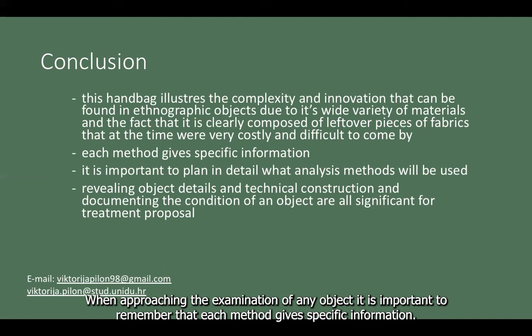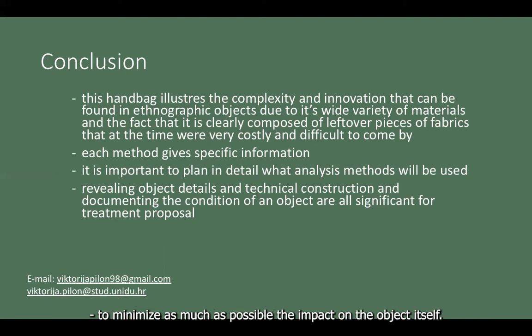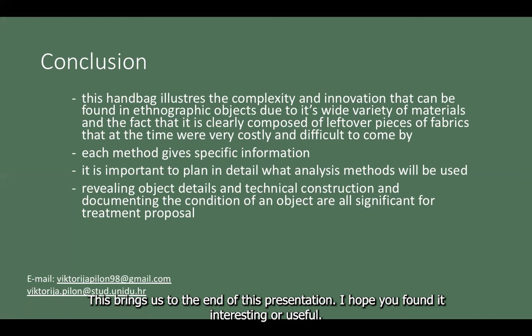When approaching the examination of any object, it is important to remember that each method gives specific information. That is why it is necessary to plan in detail what analysis methods will be used and if they require some preparation or sampling, that should be well thought out to minimize as much as possible the impact on the object itself. Revealing object details in technical construction and documenting the condition of an object are all significant for treatment proposal. And this brings us to the end of the presentation.